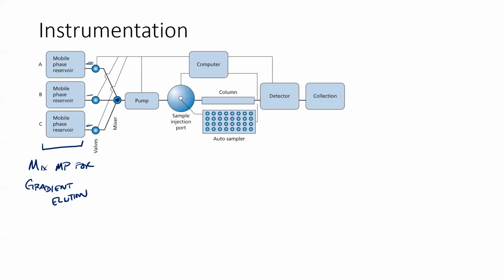These pumps are usually sort of a double pump, in the sense that if you had just a single pump, think about a piston in a car engine, or even a syringe. I'm going to pull some liquid from the mixer and I'm going to push it into the HPLC. I'm going to pull some liquid from the mixer and push it into the HPLC.